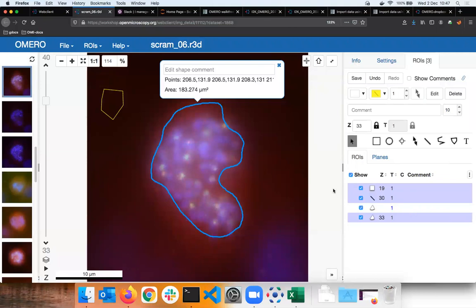In this way, you can do a simple analysis in OMERO, and that's what comes out of the box from OMERO. But we don't offer much more than that, except if you switch on the third-party tools. And this is what we are actually coming to in this section.